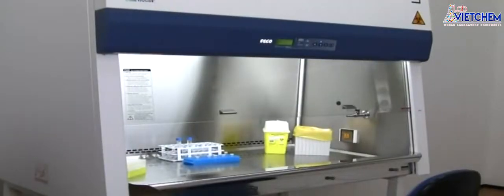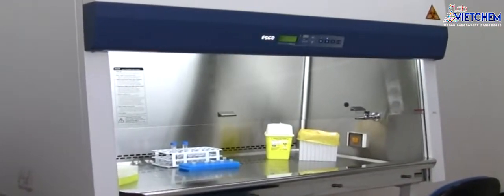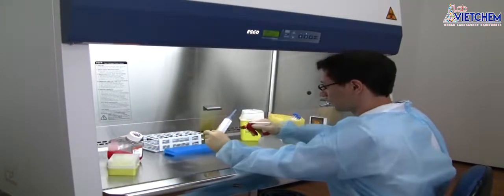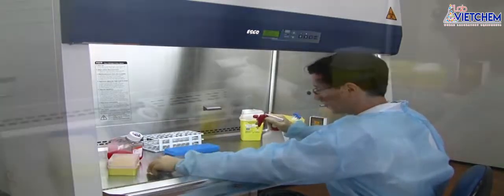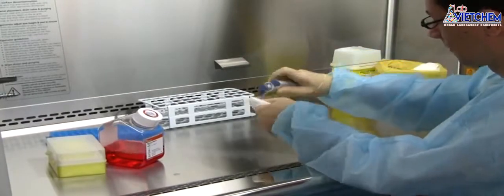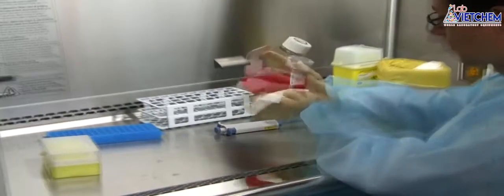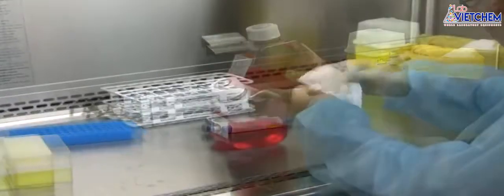After completing your work, run the biosafety cabinet for 2 to 3 minutes without activity to purge the air. Disinfect the external surfaces of all items to be removed from the biosafety cabinet. Spray the items with 70% IPA or ethanol. Leave it in the biosafety cabinet for 10 minutes and then wipe it clean. Follow your laboratory guideline for reusable and disposable item decontamination.